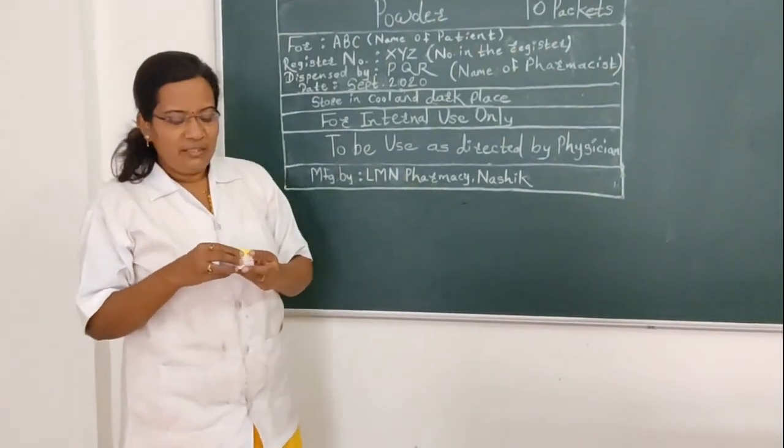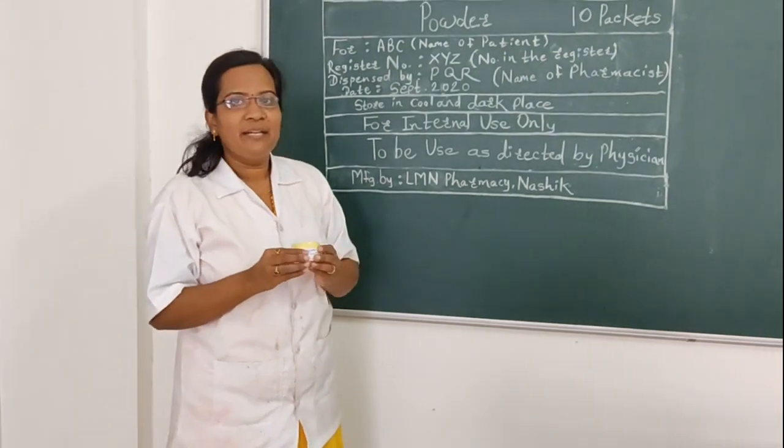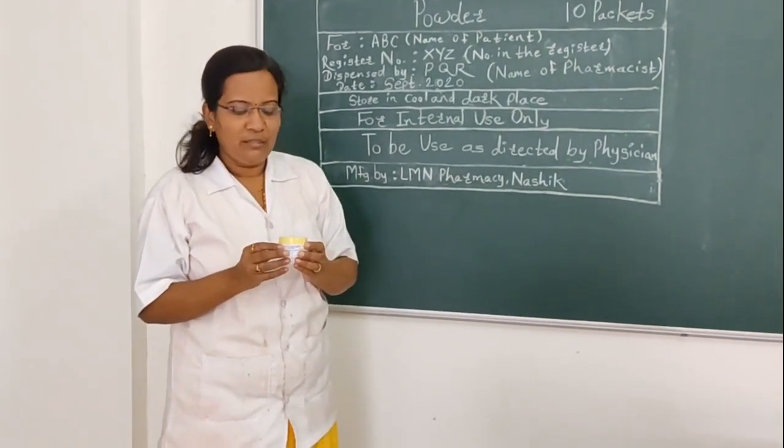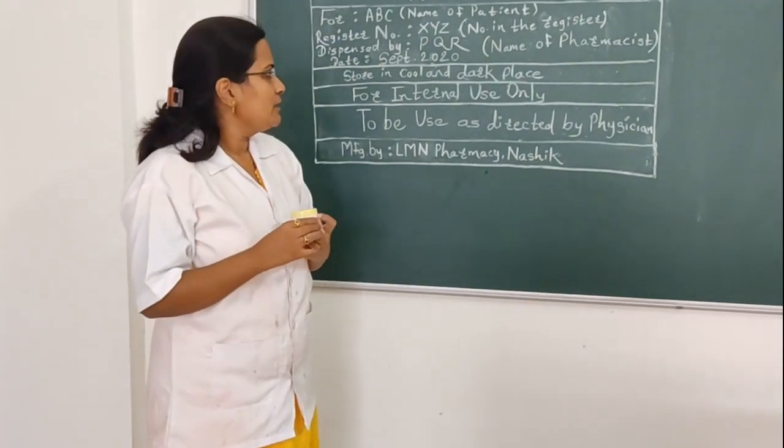Result: the 10 packets of this powder are submitted in this wide mouth bottle. The instruction on the label is for internal use only.